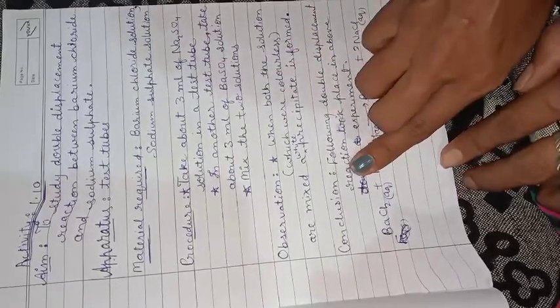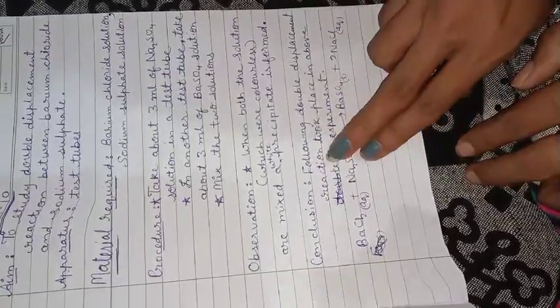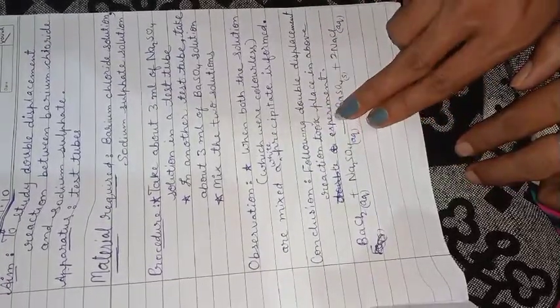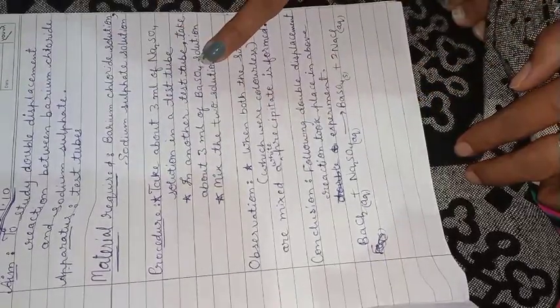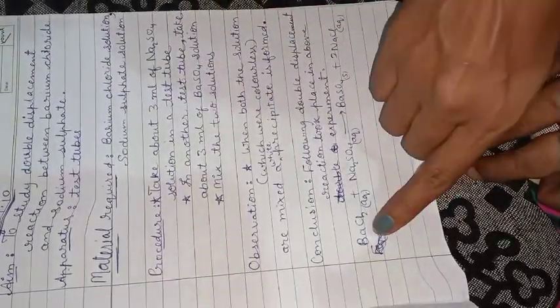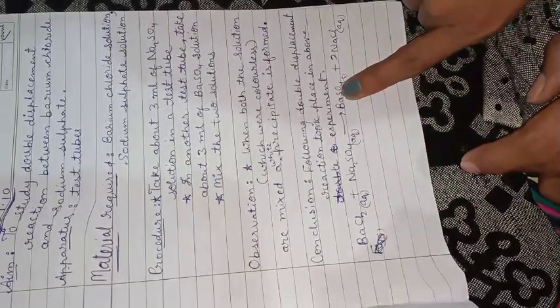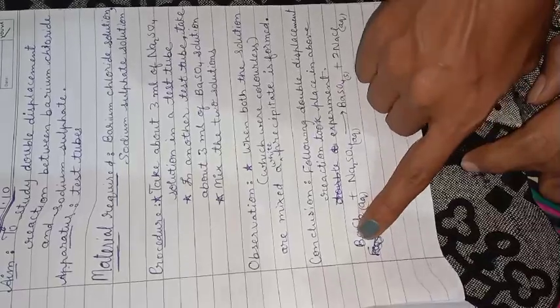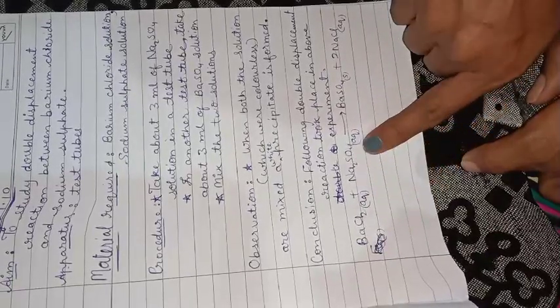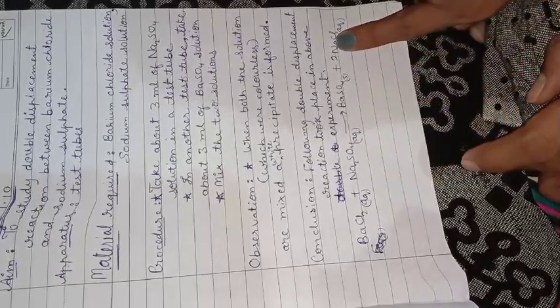Okay, so conclusion: the following double displacement reaction took place in the above experiment. In this experiment, the kind of reaction that took place is a double displacement reaction. Barium will react with sulfate and barium sulfate will be formed, and sodium will react with chlorine and sodium chloride will be formed.